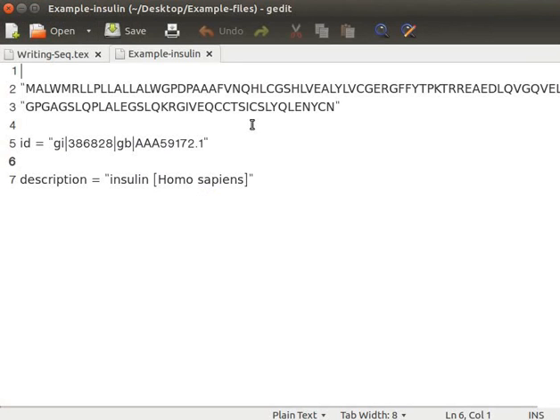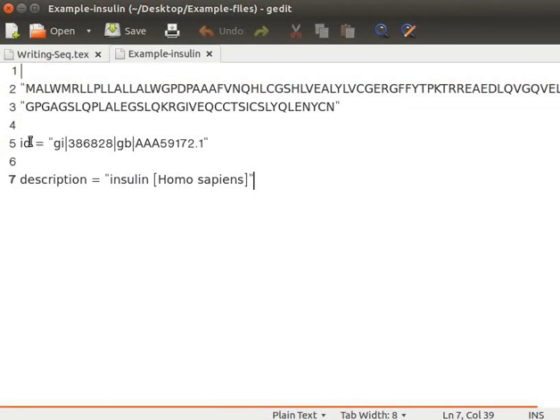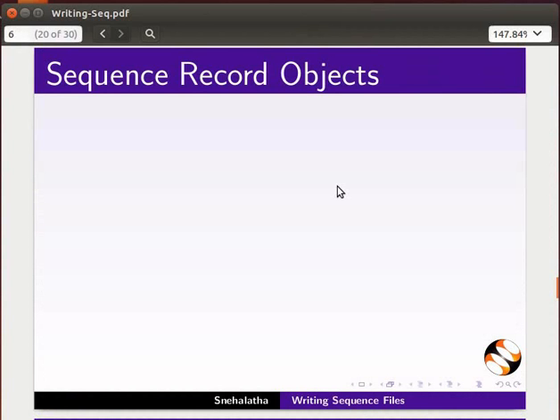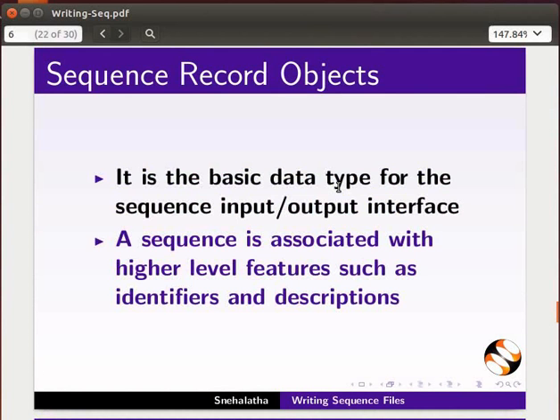Here is a text file with a protein sequence. The sequence shown here is insulin protein. The file also has information such as GI accession number and description. We will now create a file for this sequence in FASTA format. The first step is to create a sequence record object. It is the basic data type for the sequence input-output interface. In a sequence record object, a sequence is associated with higher level features such as identifiers and descriptions.